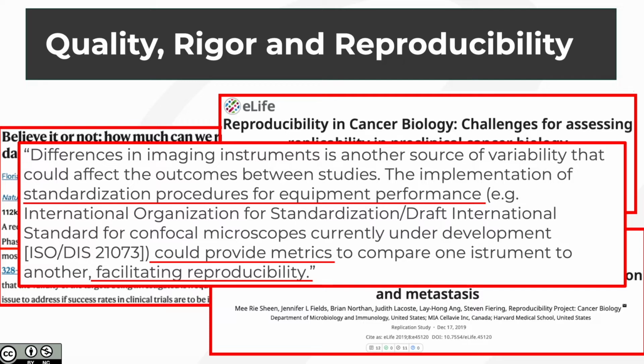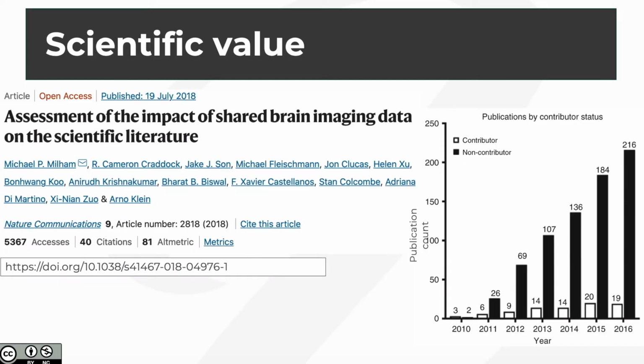that could improve reproducibility. The last topic I want to discuss is the importance of quality control and documentation to ensure sharing value for imaging data. It is becoming increasingly well documented in publications such as this one that the deposition of data sets along with manuscripts on public repositories can significantly advance science and increase the impact of our work.